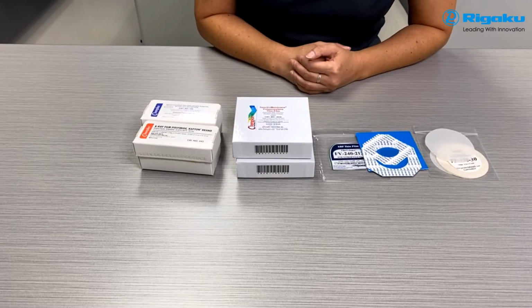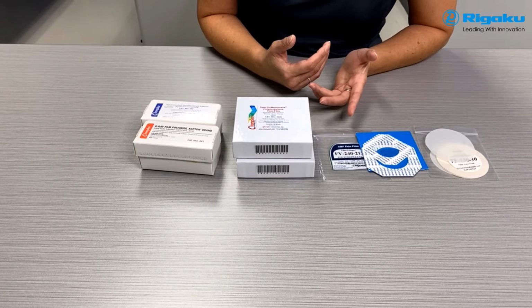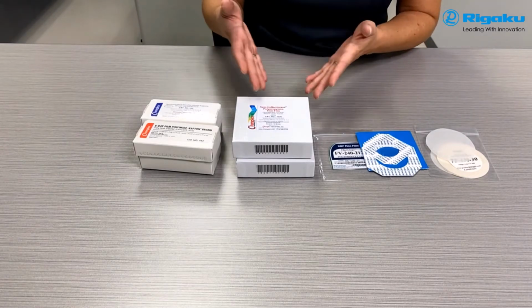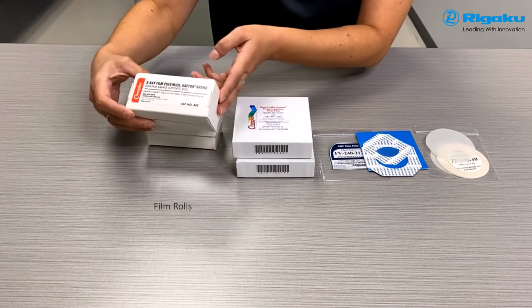Of course, they still have to do trial and error, right? Of course. And we can show them some tricks for what we do. Exactly. But besides choosing which type of film, like which X-ray transmission or chemical resistance films, there are actually different forms of the films that are typically used. You have your just regular films in a roll.